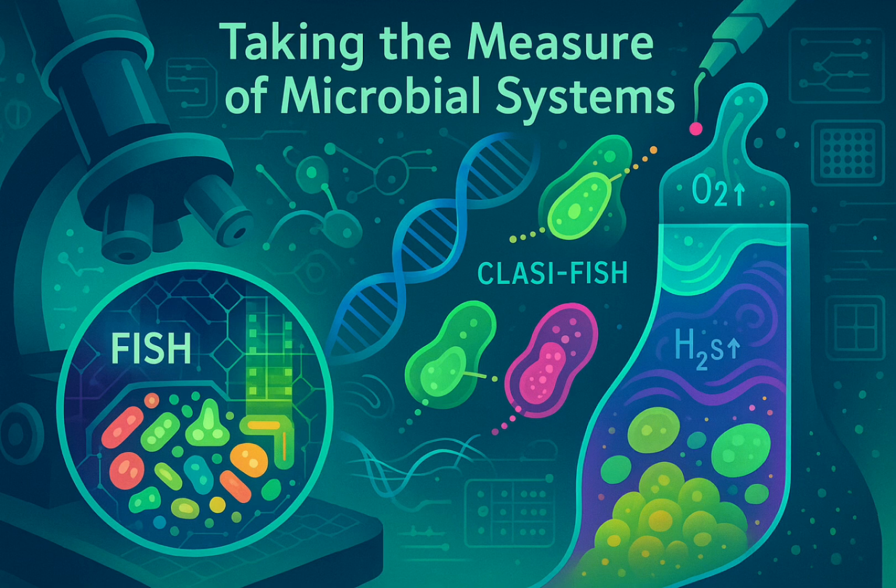And people have actually used this sorting to finally culture some of those difficult microbes. Yes. High-throughput culture methods often use flow cytometry. They sort individual cells, or very small numbers of cells, into thousands of tiny wells on microtiter plates. Each well is like a mini culture, testing tons of conditions at once. Exactly. You can try hundreds or thousands of slightly different media recipes simultaneously, often adding things like sterile seawater or soil extract, hoping to provide some missing nutrient or growth factor.